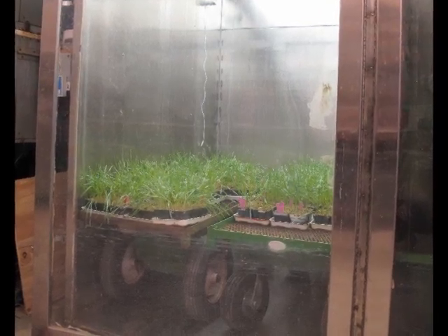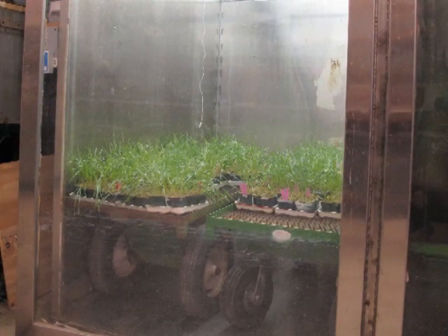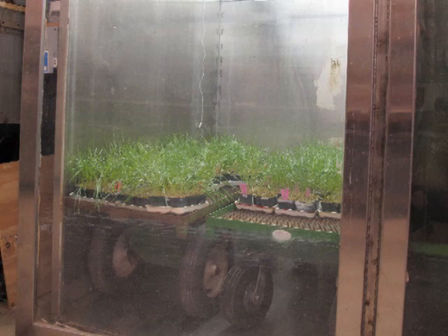After the dew chamber period, the plants need to be dried out. Before moving the plants to a greenhouse or growth chamber, you should open up the dew chamber to allow the plants to dry out. This will reduce contamination.